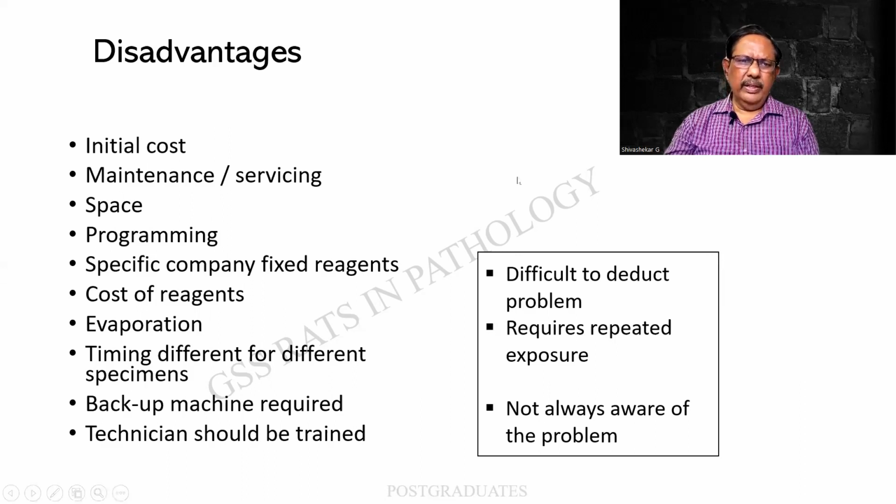And there has to be a maintenance and servicing, which again can be costly. Space, though it is small, some amount of space is required in the laboratory. Programming, therefore, there is a software now, and that has to be programmed well. And we will have to procure the reagents from specific company and not compromise on it. This again can be a little cost oriented.